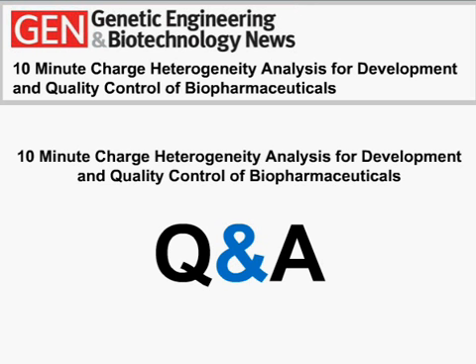Thank you, Karan. And Carrie, question for you. For the protein concentration determination, is the calibration curve based on the total peak area or main peak area? Any sample pretreatment? Carrie, did we lose you? Hi, I apologize. Technical glitch. Okay, let me read that again. For the protein concentration determination, is the calibration curve based on the total peak area or main peak area?